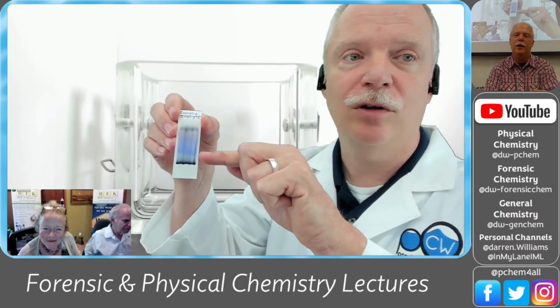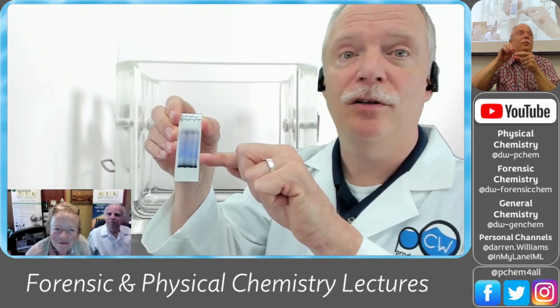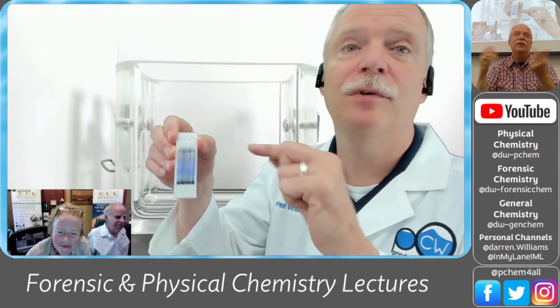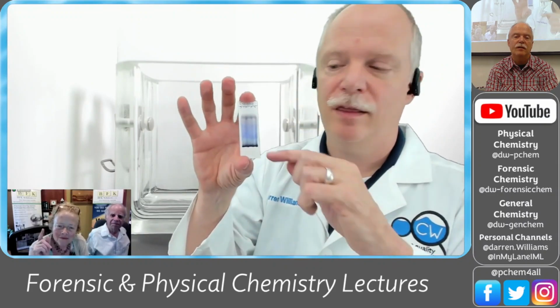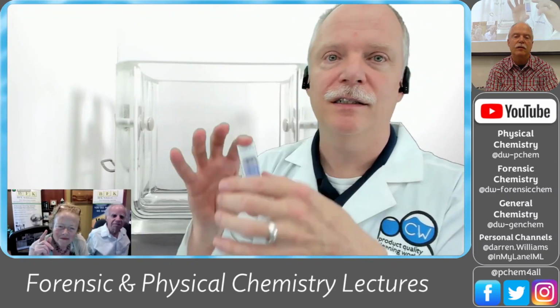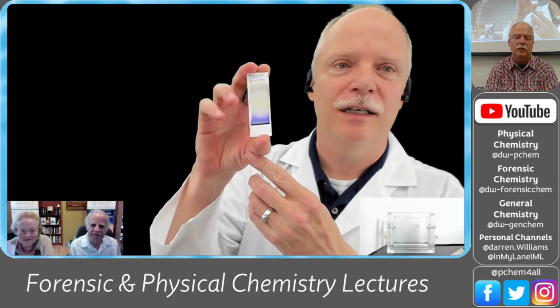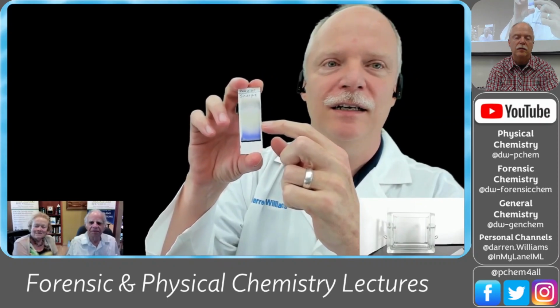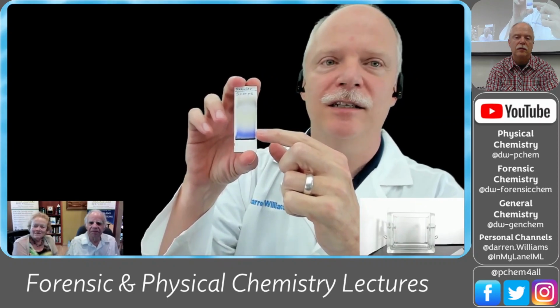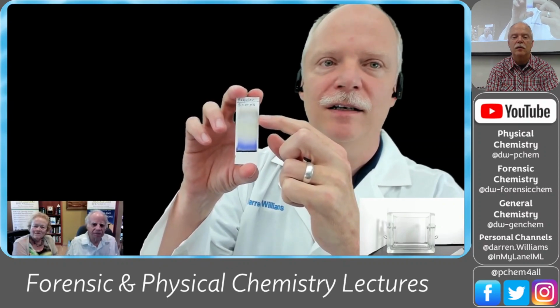Likewise for this blue line, it might have a travel ratio of about 0.25. And so that number is repeatable. You can then describe these compounds with their travel distances, and that's a repeatable number. And this was the regular Sharpie. It's much more colorful, and again this blue peak is not very well retained, or is retained well by the stationary phase, so it's polar. The yellow is kind of hard to see today, but it's right there.